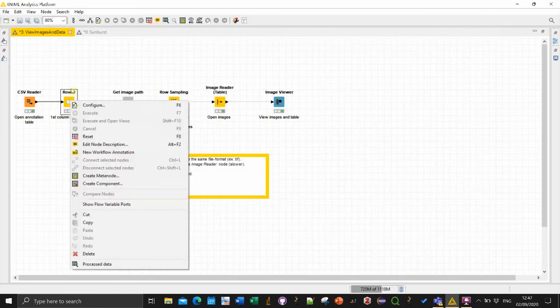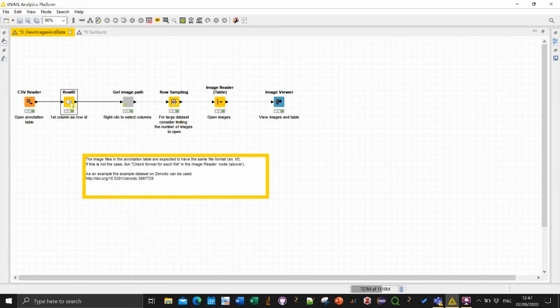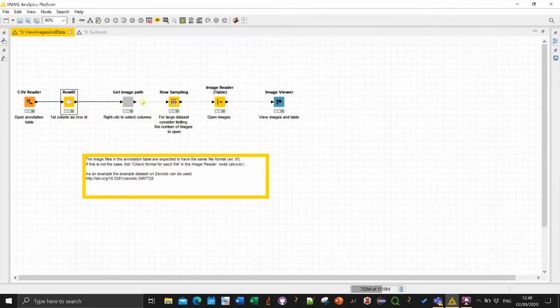That's why we have this red exclamation mark but it's no problem. Then just set the row ID of the table to the column index here. So then it's a bit nicer to visualize.